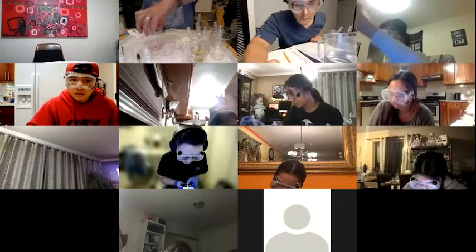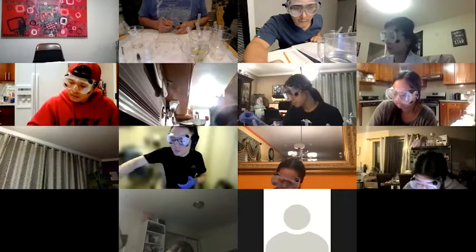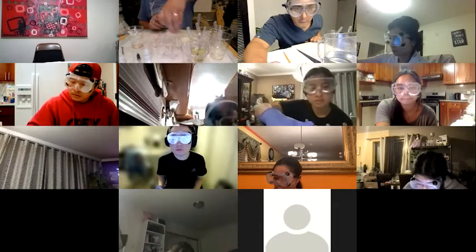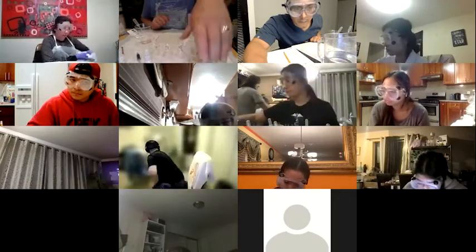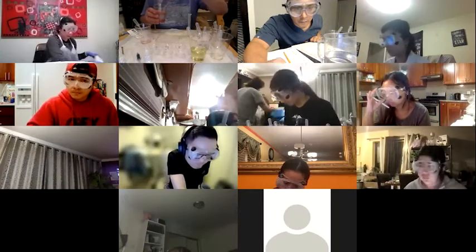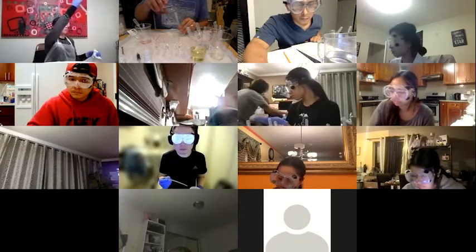There we go. Make more of the 4.7, so equal parts acetic acid and acetate.